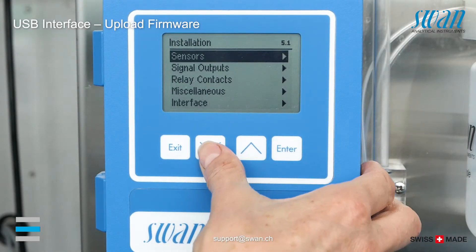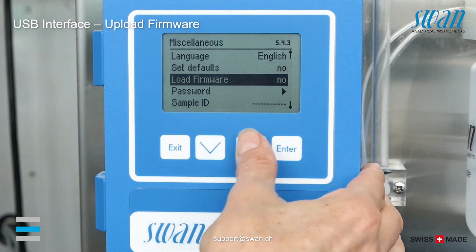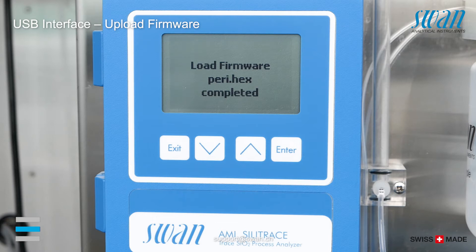Go to Installation, Miscellaneous, Load Firmware and select Yes. The firmware upload starts immediately.